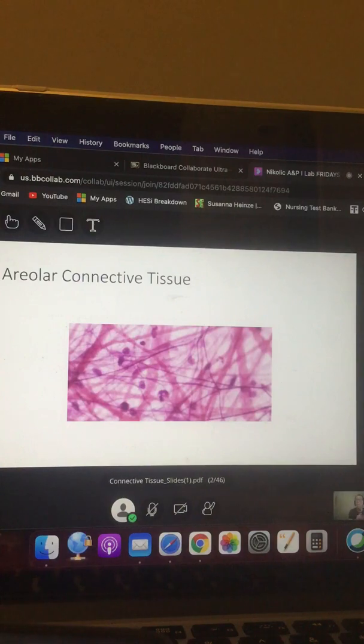Fibroblast is a cell, right? So we're going to be looking for a nucleus because you can't make out the cell membranes here. So basically what we normally do is we normally choose a nucleus that's close to these fibers there, right? But we only want one cell. So if we label a nucleus, guess what you tell me?